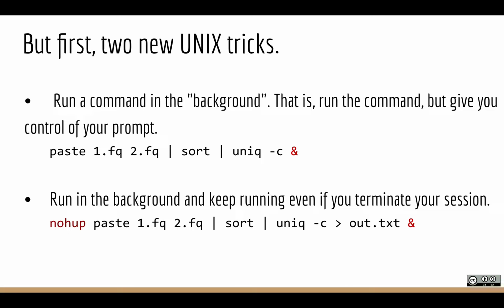But as we're going to find, if you haven't found already, maybe even in homework 3, some of these commands can take a while. If the files are really, really big, that is, they have, say, billions of lines in them, in the case of a FASTQ file from a full whole genome sequencing run, it might take sometimes hours for those commands to finish.